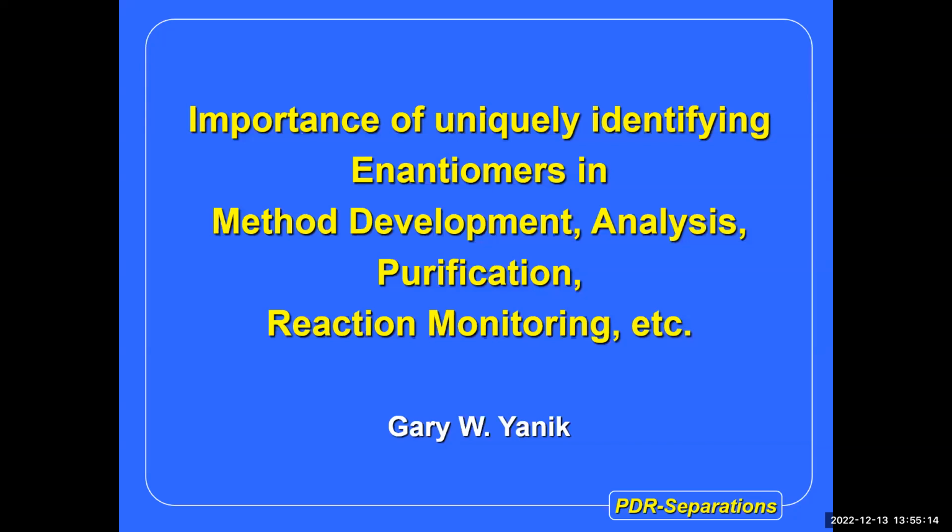Going to talk about the importance of uniquely identifying enantiomers in method development, analysis, purification, and reaction monitoring.